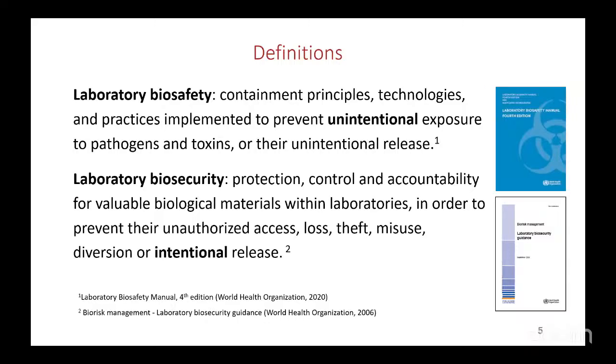So what is biosafety? Laboratory biosafety is the containment principles, technology, and practices implemented to prevent unintentional exposure to pathogens and toxins, or their unintentional release. That's biosafety. All the principles, all the technology, all the practices we implement to prevent unintentional exposure to pathogens, to toxins, or their unintentional release is what we call laboratory biosafety.